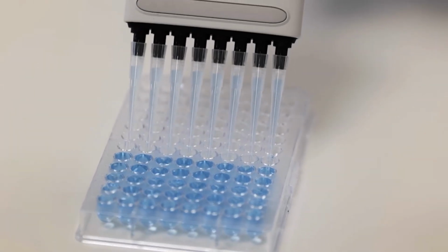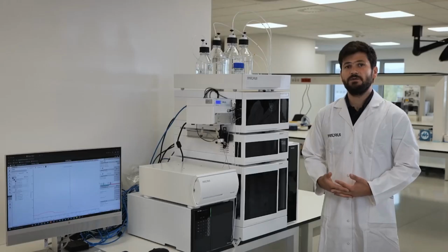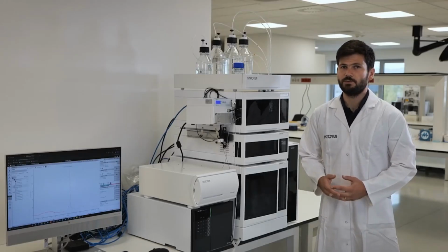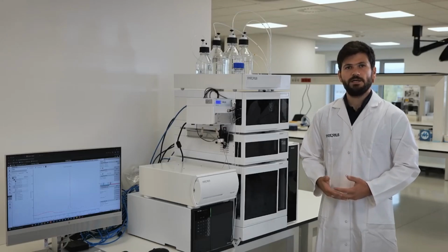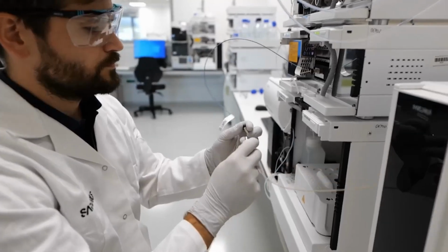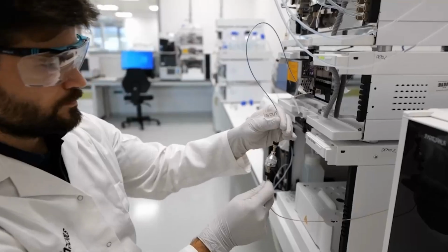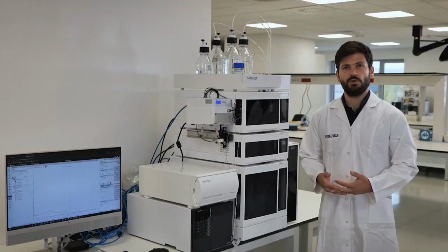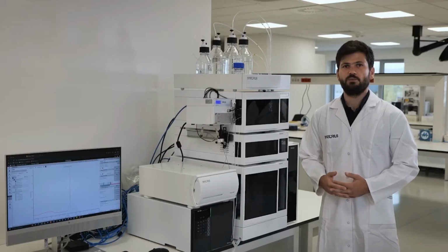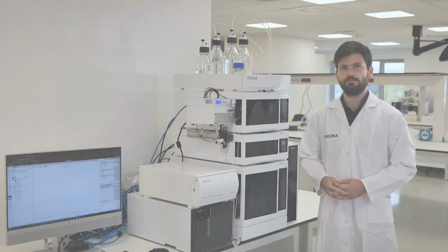The downstream process is always optimized to a specific starting material with target AAV full capsid titer, volume, and both process and product-related impurity profiles. By analyzing the starting material, such as cell lysate, with UV, fluorescence, and multi-angle light scattering detectors simultaneously, it becomes much easier to adjust the downstream process steps to the quality of the starting material. Likewise, requirement ranges can be put in place to ensure only material with sufficient quality proceeds further downstream.